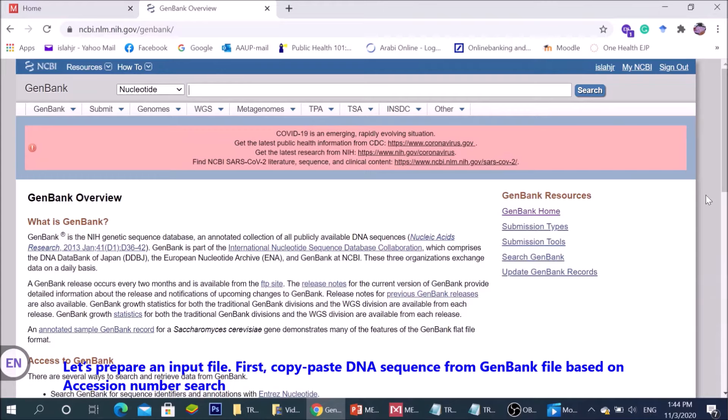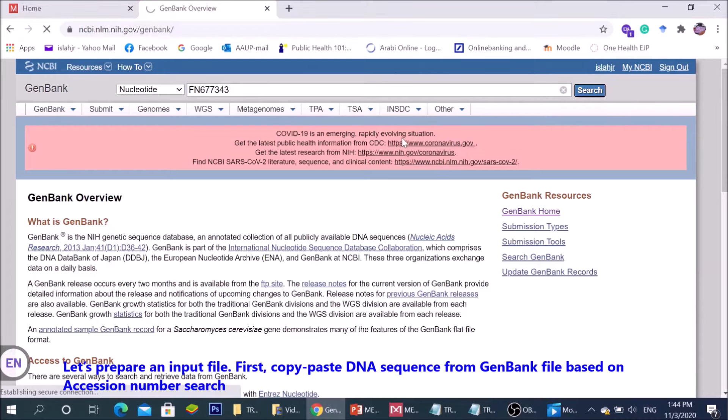Let's prepare an input file. First, copy and paste DNA sequence from GenBank file based on accession number search.